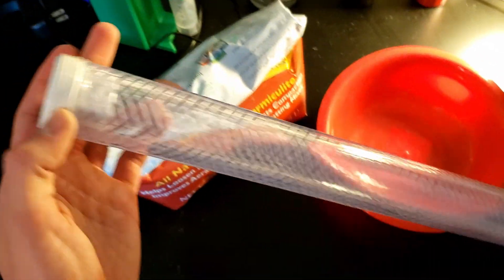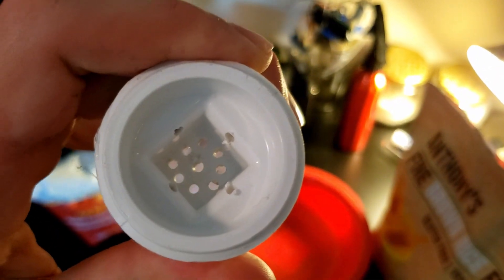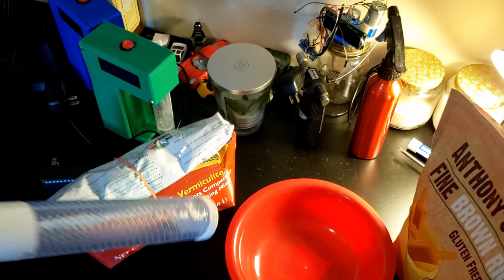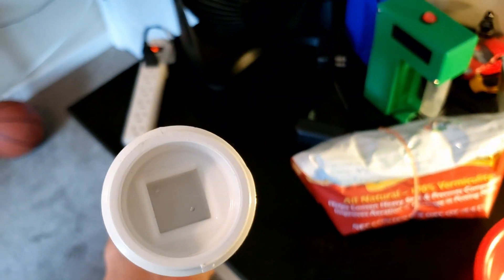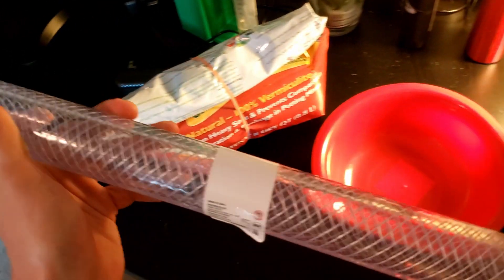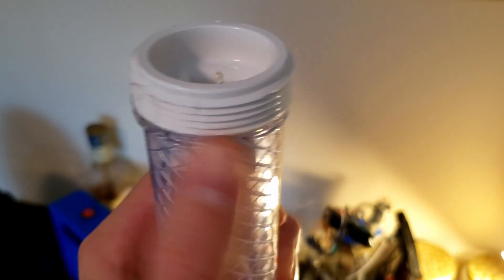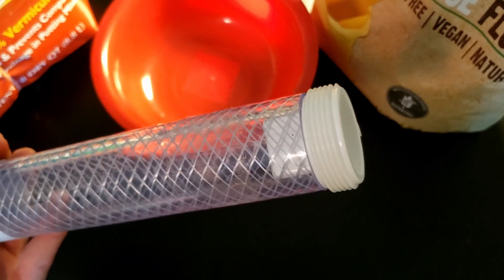We've got our reactor sort of put together. This will be the drain end — there are a lot more holes in the bottom. This is going to be the feed end — there are two tiny holes there. The bottom is hot glued in place for now; the top is just pushed in.